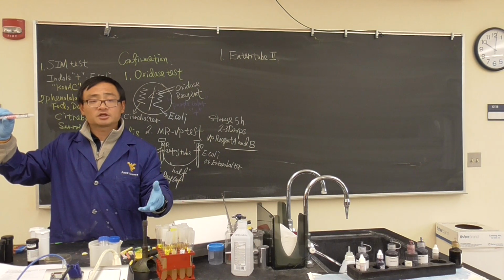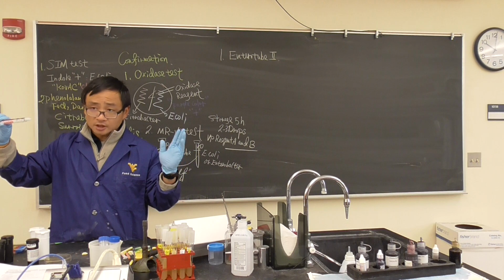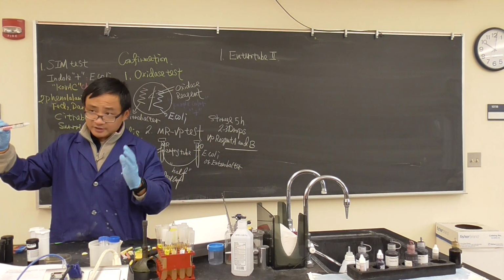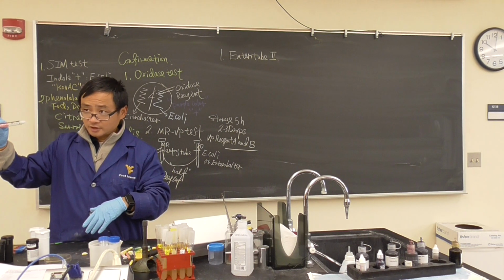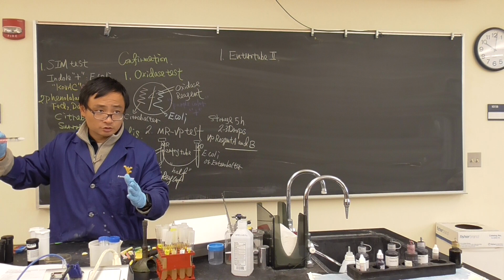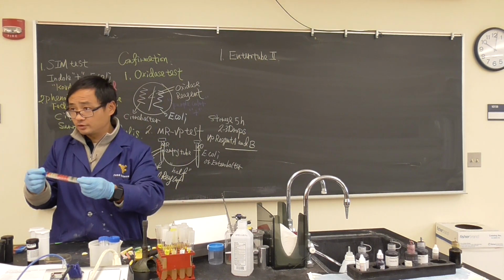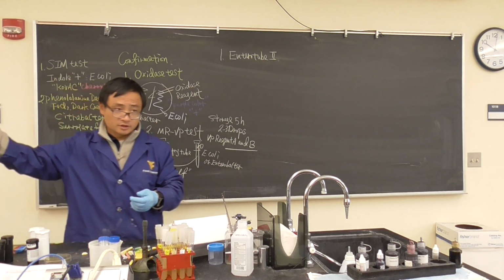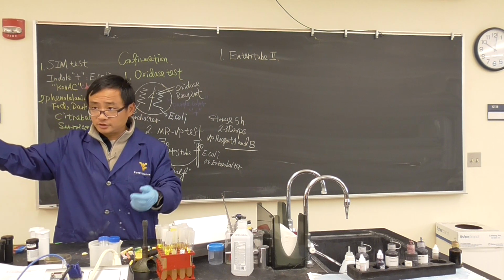After incubation, you see the color change. The bottom line is that the whole classroom needs to be the same color. If I see some different color, it means you're contaminated with something else. And we're not going to read the code, okay? It's too complicated. Then you can take it home on Thursday. That will be your gift. If you don't like it, you can just give it to me and we'll throw it away. If you like it, put it on your bench and take it home.